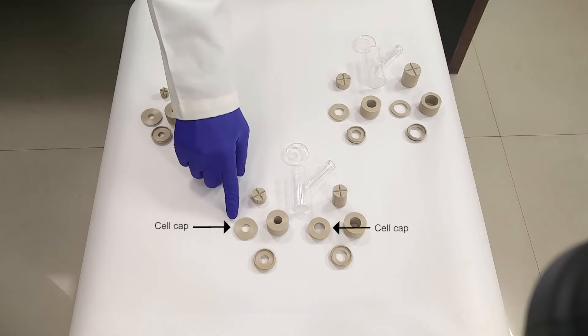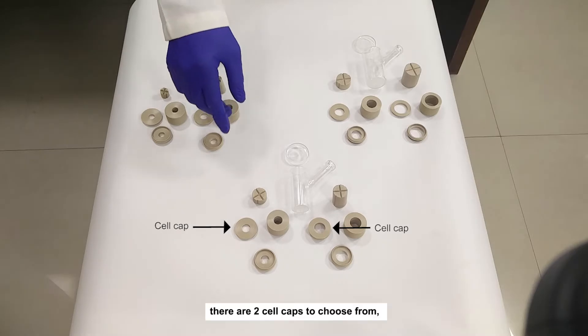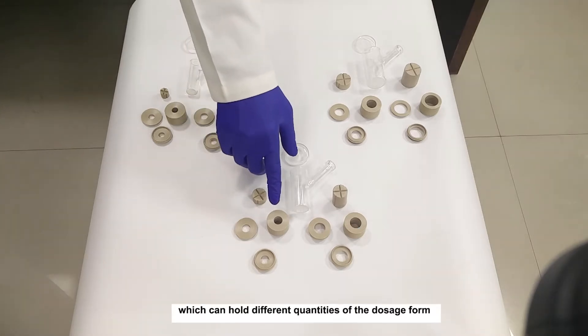The cell along with the stirrer makes the receptor compartment. The donor compartment comprises of the cell cap. The cell cap holds the dosage form for each cell. There are two cell caps to choose from, which can hold different quantities of the dosage form.